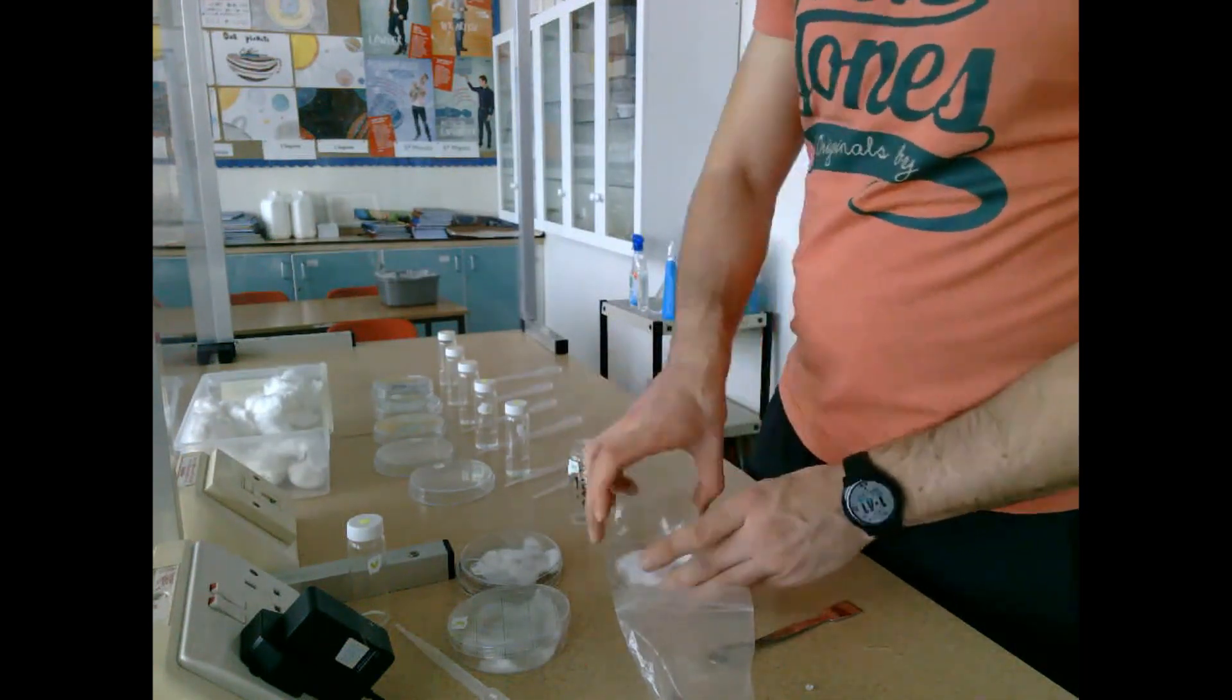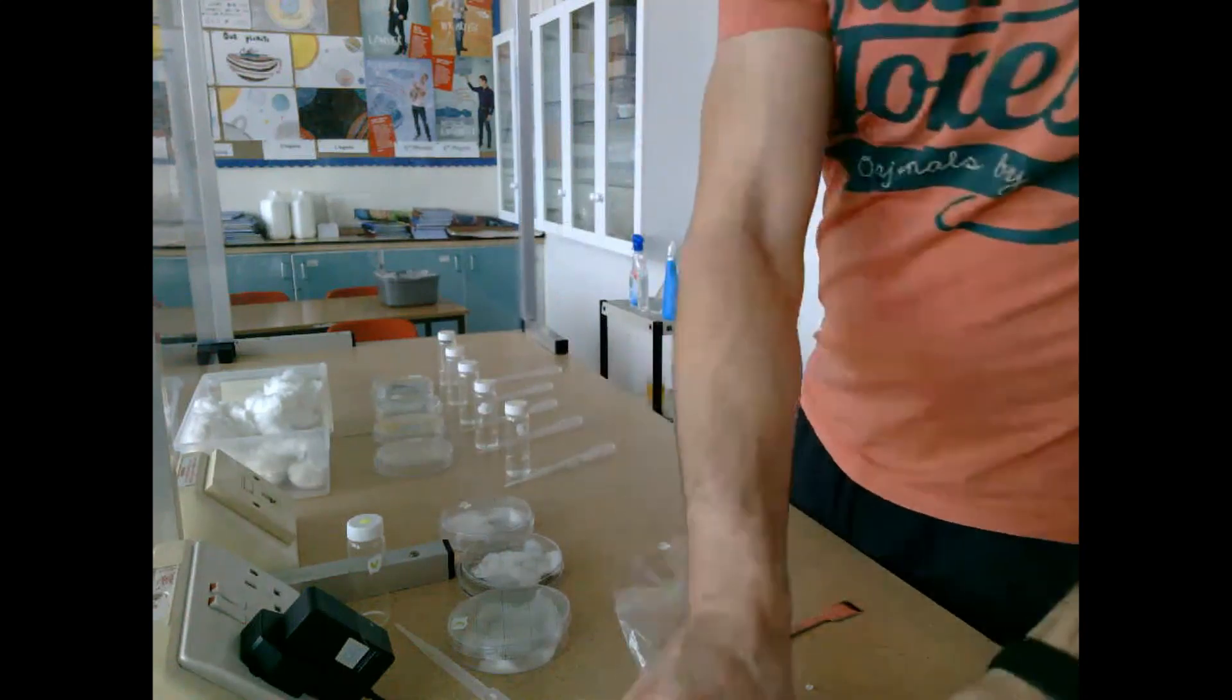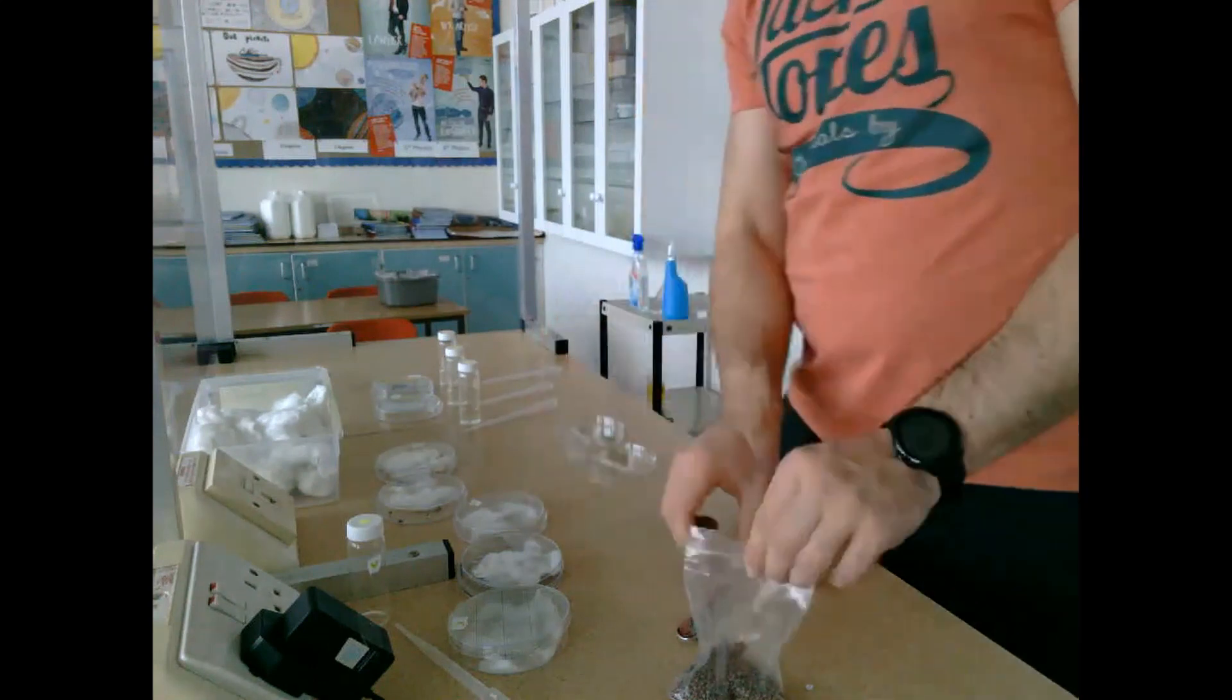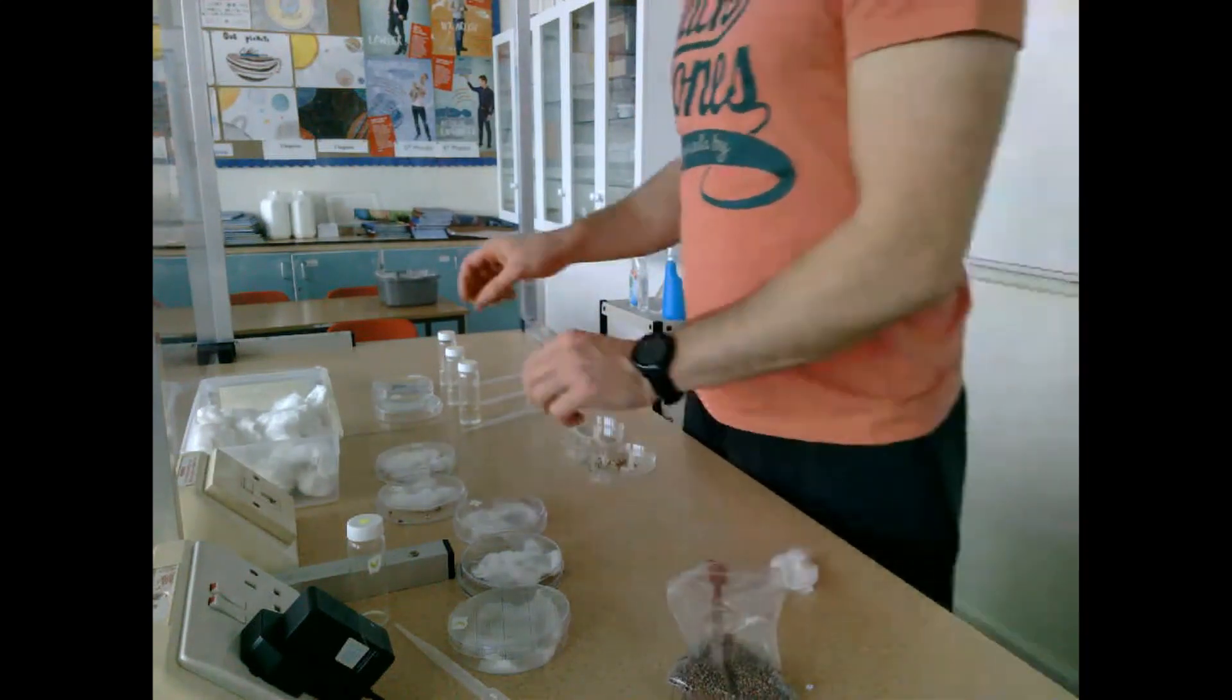I'm going to take these petri dishes and place them into an incubator for between three to five days at about 25 degrees, and then I'll be able to get the results at the end of this process.